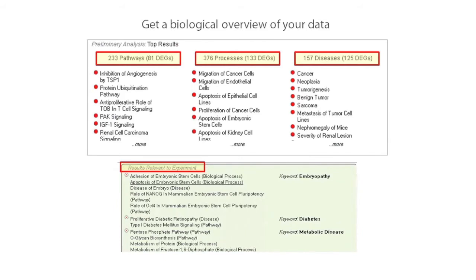Clicking on a result, such as adhesion of embryonic stem cells, will let you identify which of your differentially expressed genes are known to be involved in that topic, so you can go on to explore just those genes in more detail in iReport.